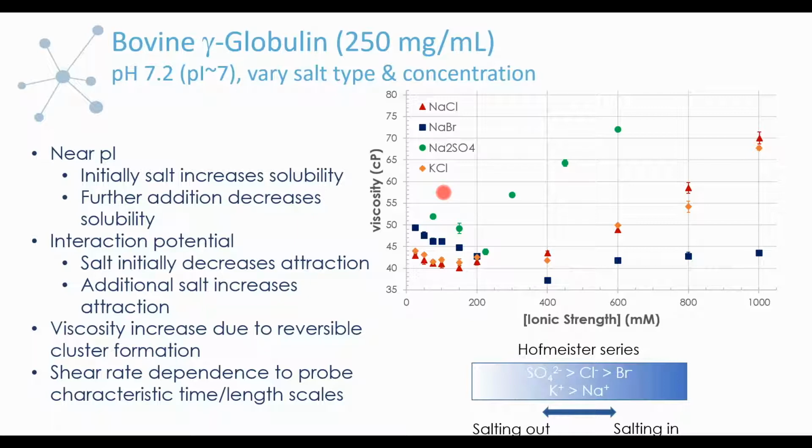Although this is a little less well defined than the way I described the BSA, because for these types of protein molecules, when you start introducing the salts, the behavior can be quite complex, and the trends that you see can vary a lot depending on where you are relative to the isoelectric point, and even just for the individual molecule in general. So I'm going to speak in more general terms, not so specific as I did for the BSA, because it's a little more complicated.